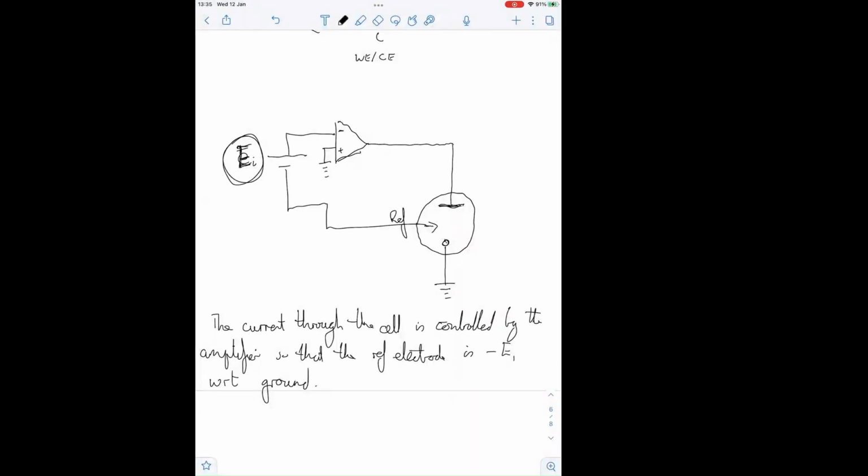So the first thing to realize here is that actually you ground your working electrode. So in the default potentiostat, the working electrode is grounded. On most potentiostats these days, you can go into the software and choose to float your working electrode, which means they float that and they float that. But be aware your working electrode is grounded, typically.